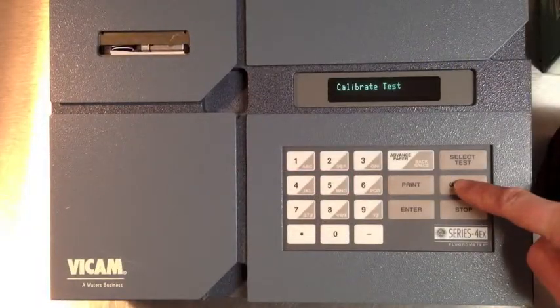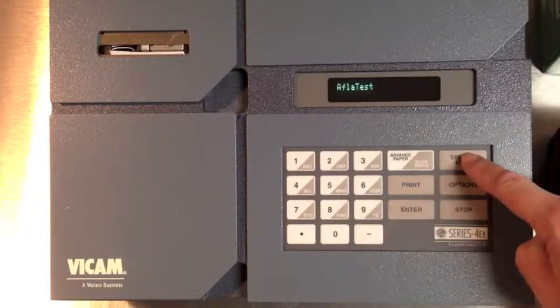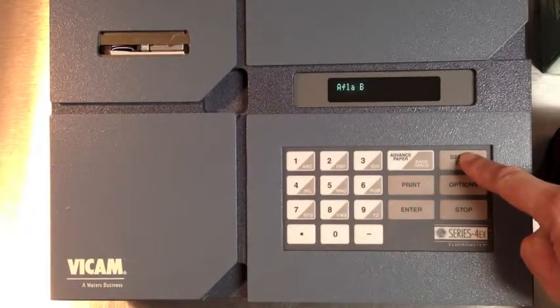Turn on your fluorometer and select Options. Press Enter to select Calibrate Test. Press Select Test to choose Fumani Test, then press Enter.